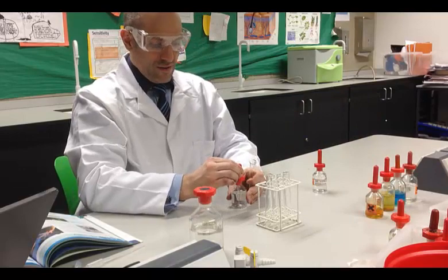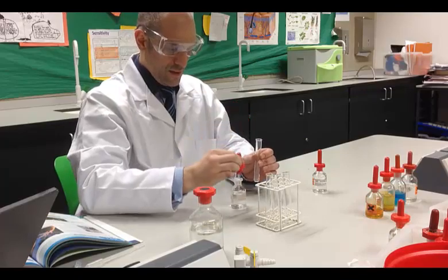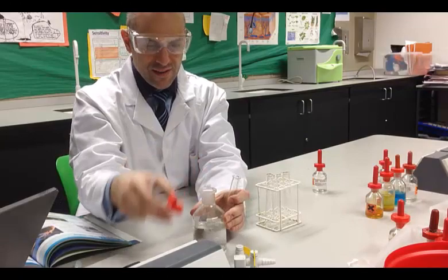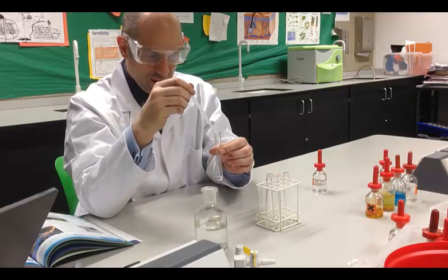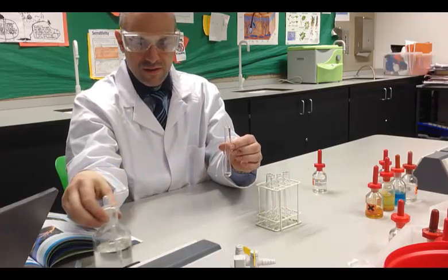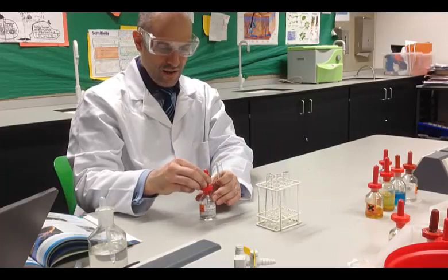Aluminium first. Going to add a few drops. Okay, as usual, we use a strong acid to dissolve away any unwanted solid. In this case I'm going to use hydrochloric acid. A few drops of that. And now the test reagent, sodium hydroxide. Watch carefully.